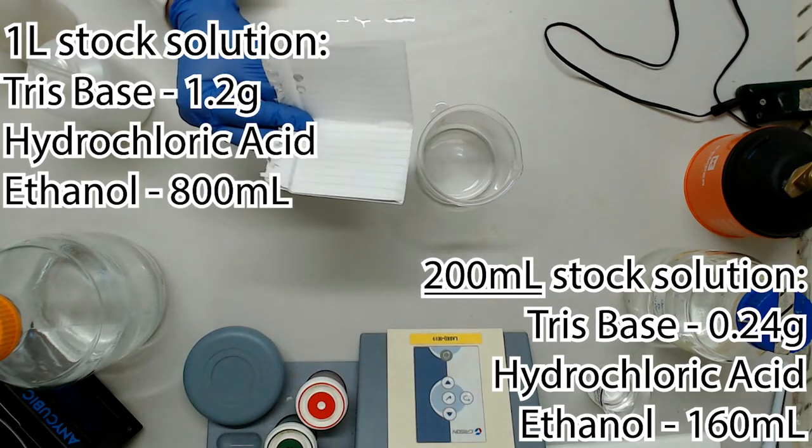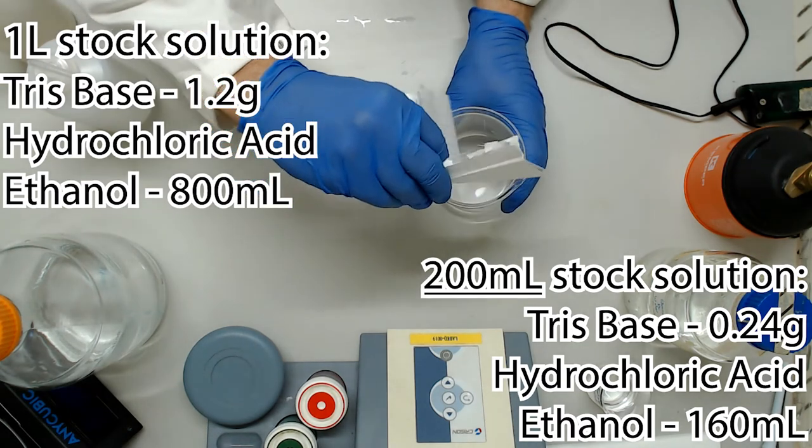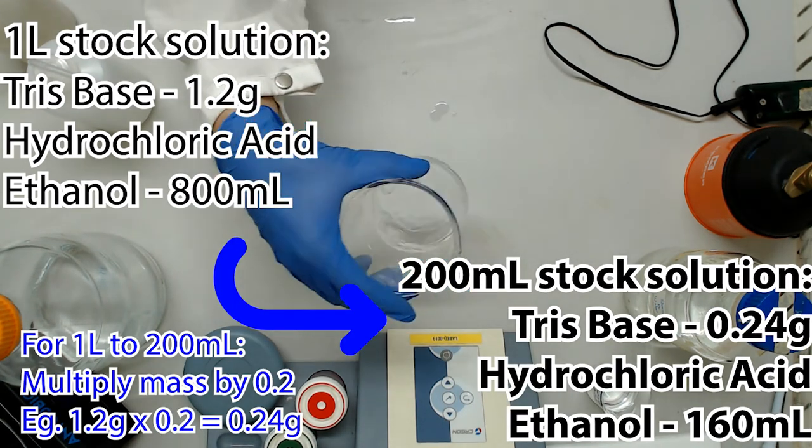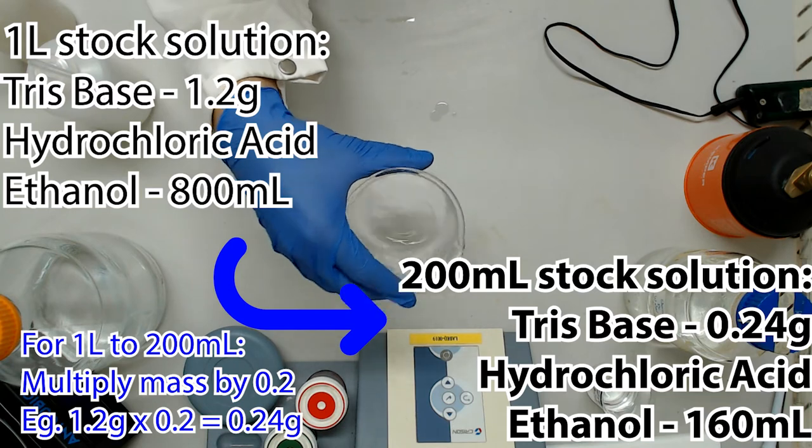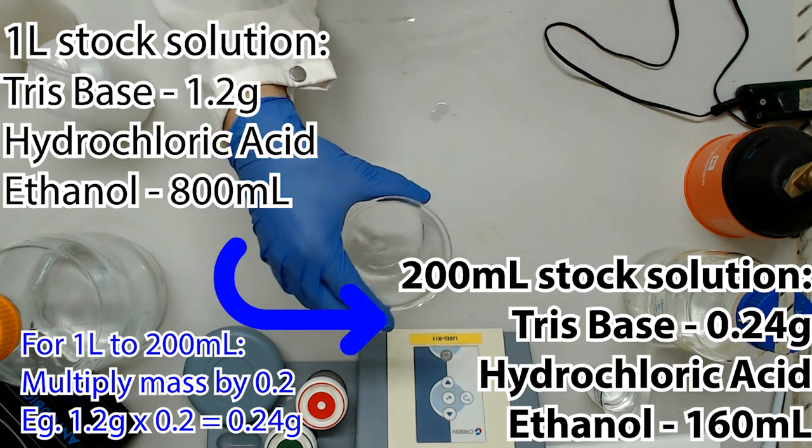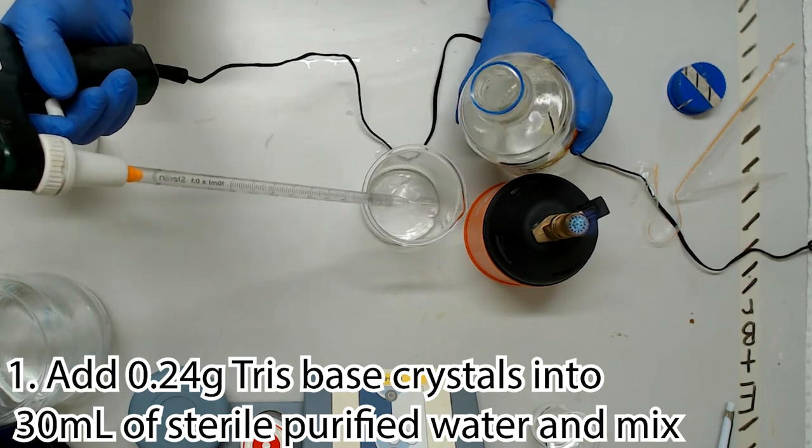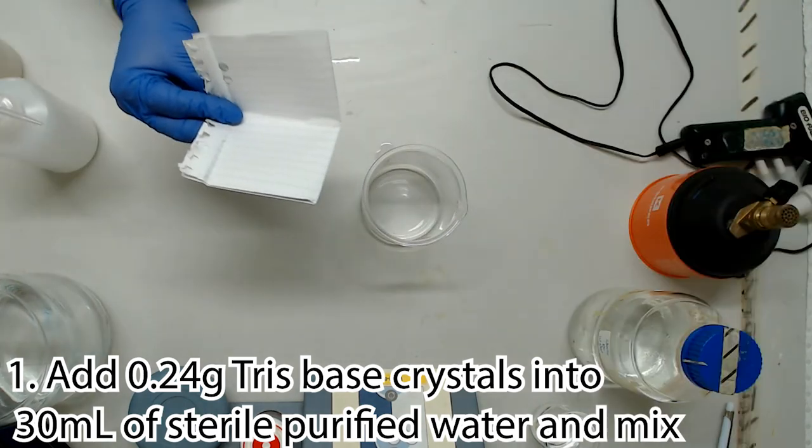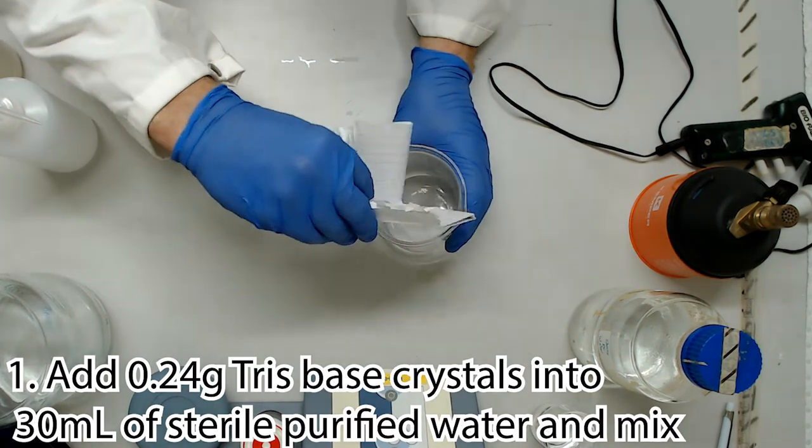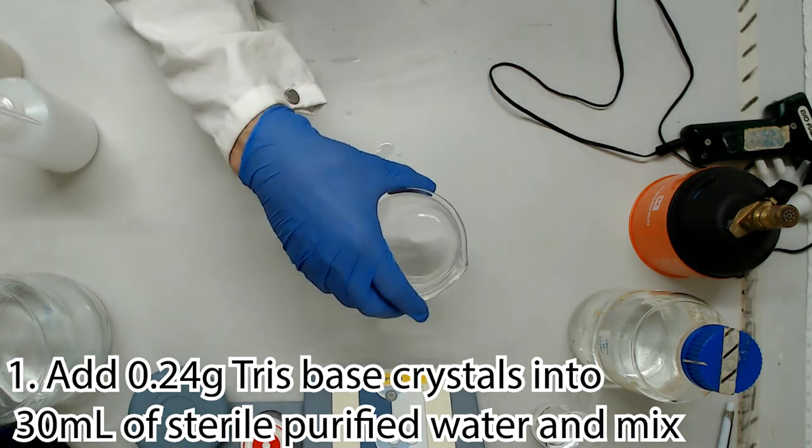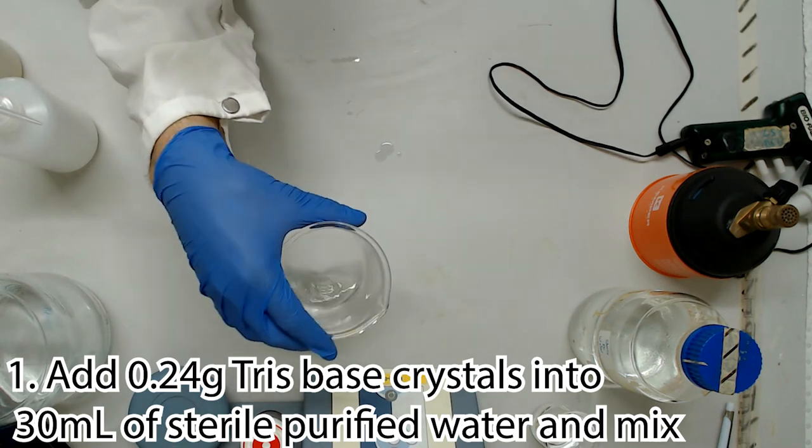We're going to make double the quantity of buffer PE than we do of any other buffer, since we use almost twice the volume than in the other steps. As such, the demonstrator will be making 200ml of buffer PE and will include the conversion from 1L of stock on screen. Starting with 30ml of autoclaved pure water, we're going to add 0.24g of Trisbase crystals, mixing slowly to allow them to dissolve. Heating is optional to speed up this process, but not necessary for such a low concentration of salt.